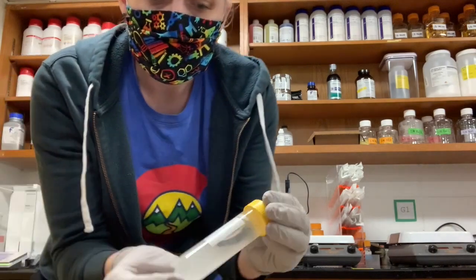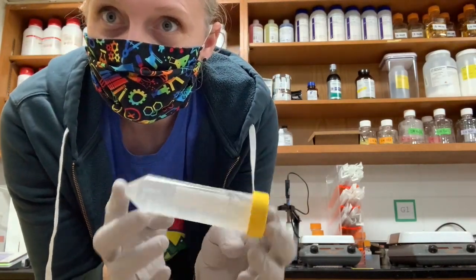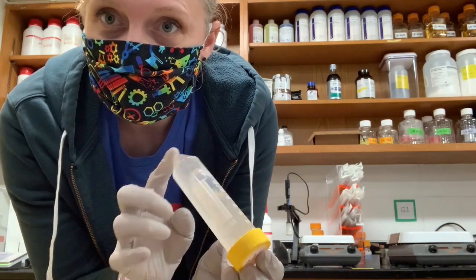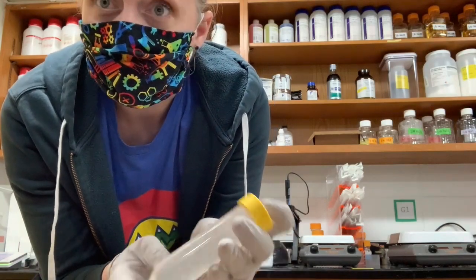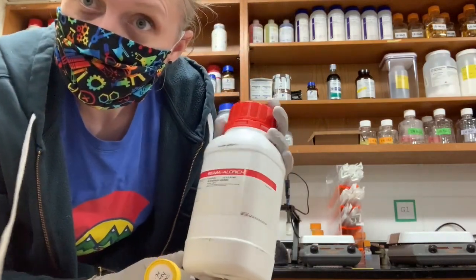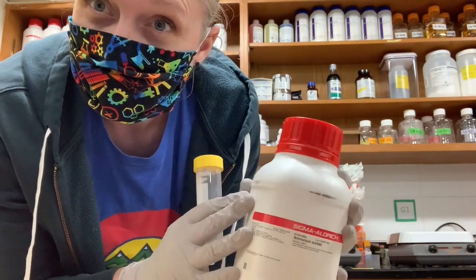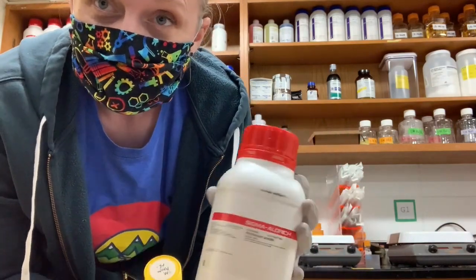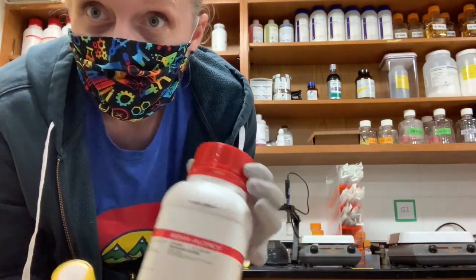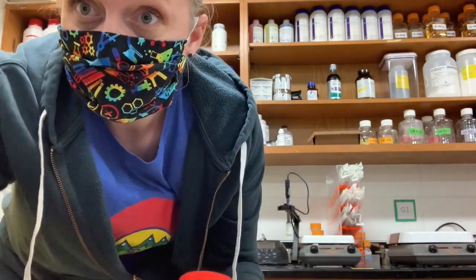And then I'm going to put this on the shaker so that the powder can go into solution. It'll take maybe an hour or two. You always want to make sure that you put the powder back right away, especially this one, which is supposed to stay in the fridge, so you don't want to leave any cold reagents out. So this is a time when you're making solutions to always be cleaning up after yourself. You don't want to ruin a reagent by leaving it out.